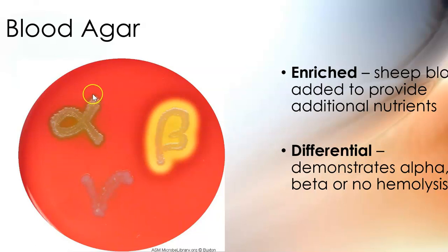It's green. It's actually a green color. On blood? It's on blood? Oh, that has to do with byproduct, cellular products. Yeah, that's just cellular products. That's not hemolysis at all. That's just the biochemical changes that are produced, and it changes the appearance of the plate. Yeah, it's not an actual hemolysis.